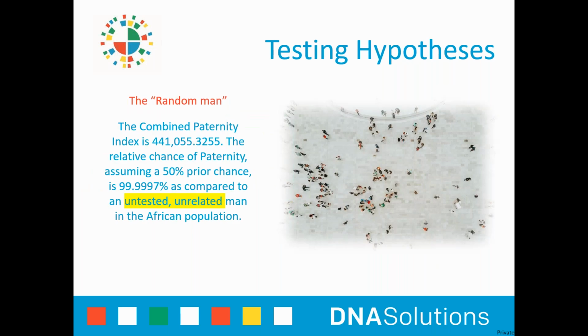All right, so you have all your markers for your samples. So what are we testing? I'm going to talk about testing hypotheses for the next couple of slides. In most paternity and maternity cases, you're first testing whether the father or mother is excluded as a parent of the child in this case. We consider a parent excluded if there are mismatches at more than 2 loci. So you think of that inheritance tree, and if you test 23 markers and there's a mismatch at 6 of them, that means that person can't be the parent.